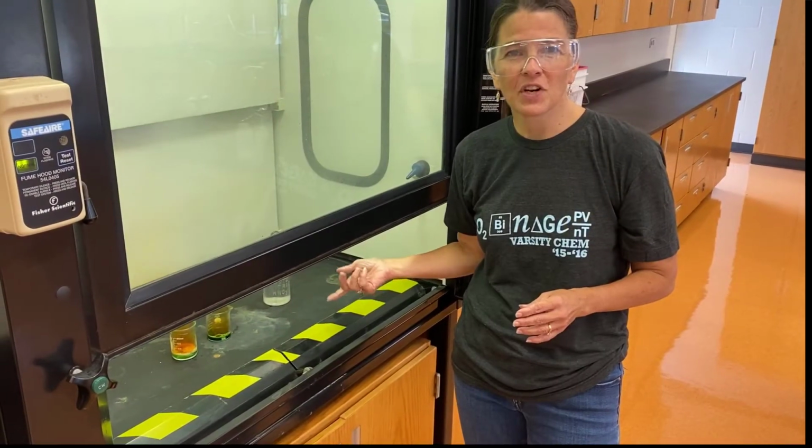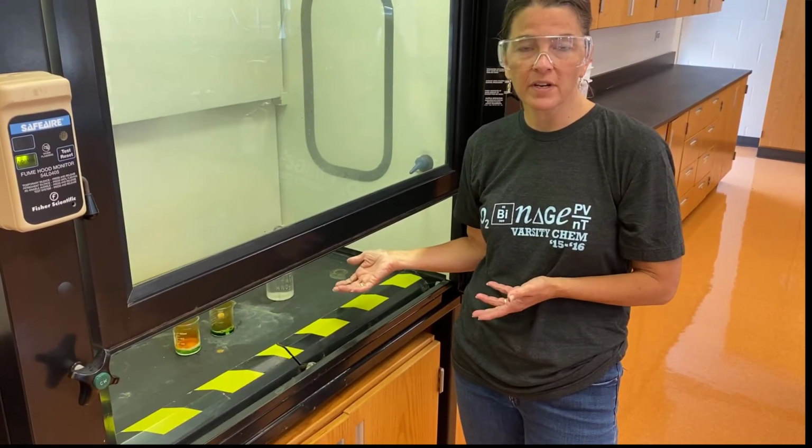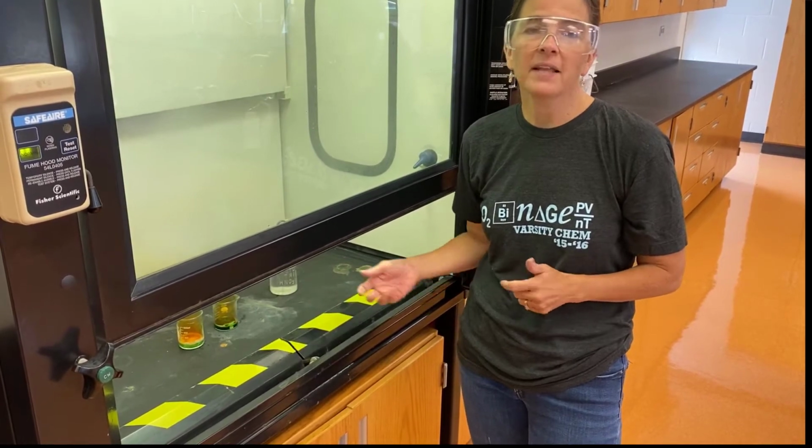You can see the solutions have started to change color. The reaction is clearly occurring. We're going to let this progress overnight and then come back to it in the morning.